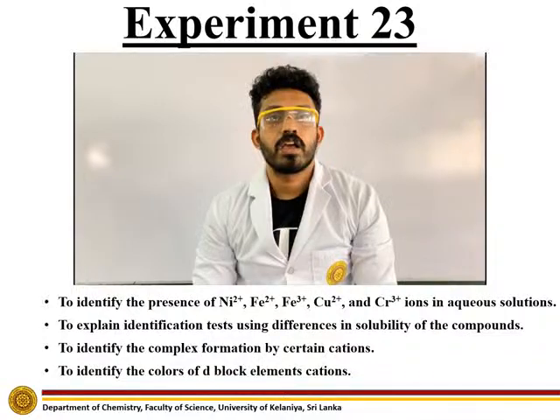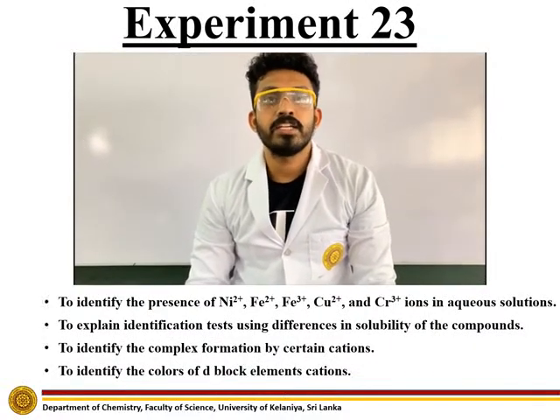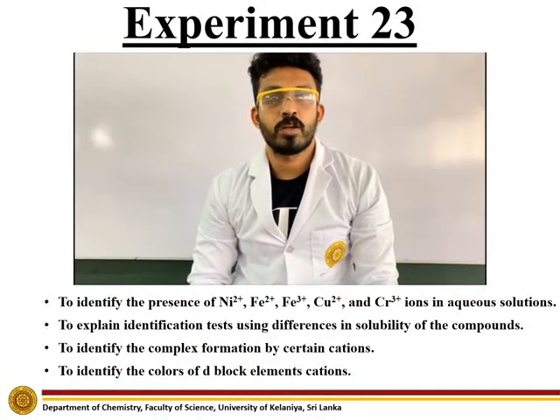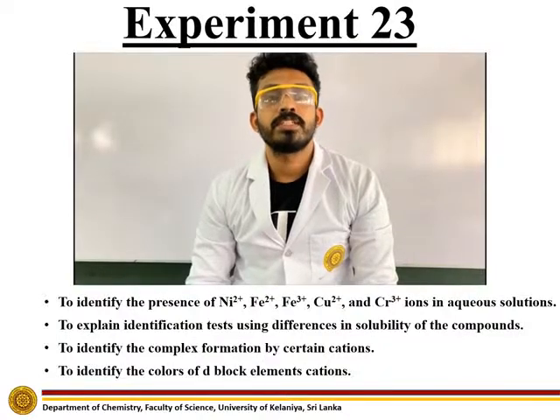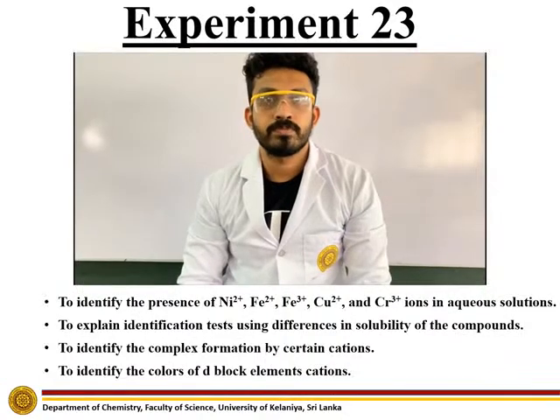Objectives: Identify the presence of these ions in aqueous solutions. To explain identification tests using differences in solubility of the compounds. To identify the complex formation by certain cations. To identify the colors of d-block element cations.